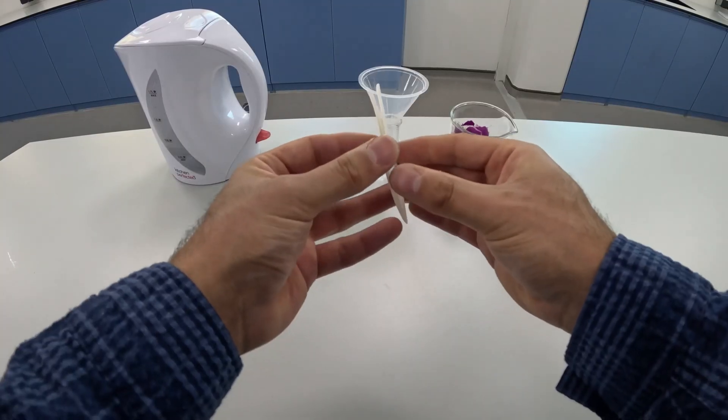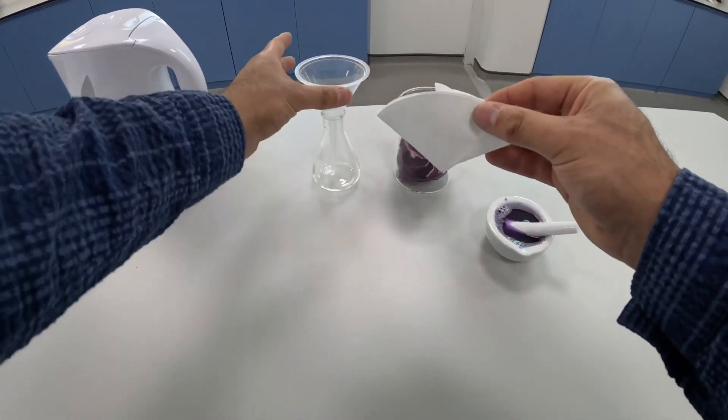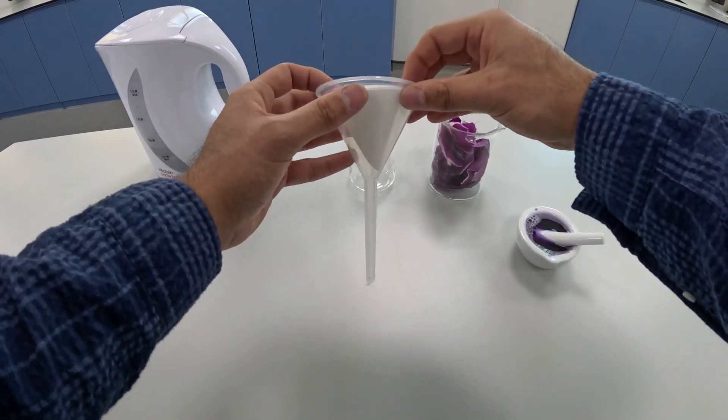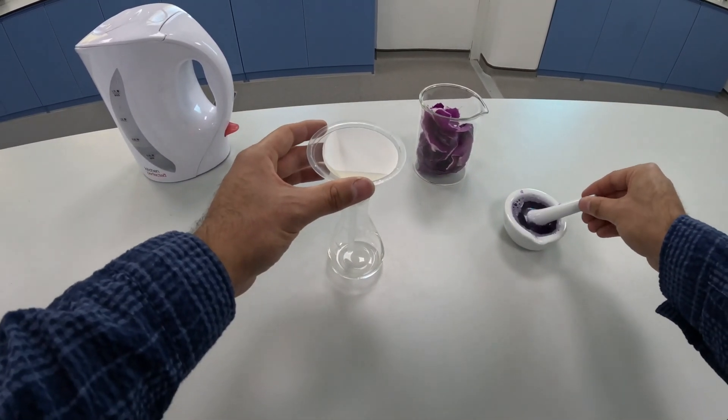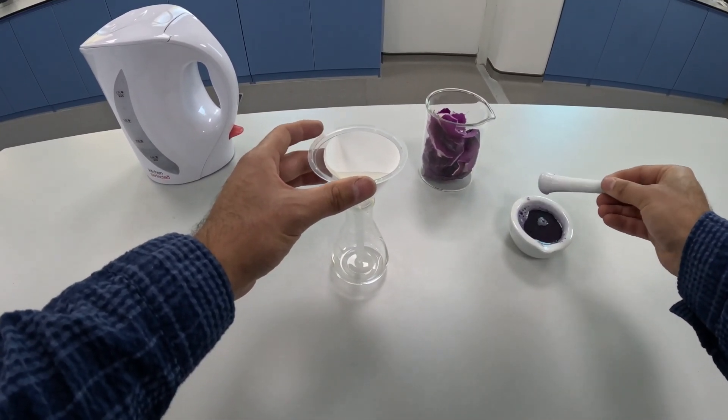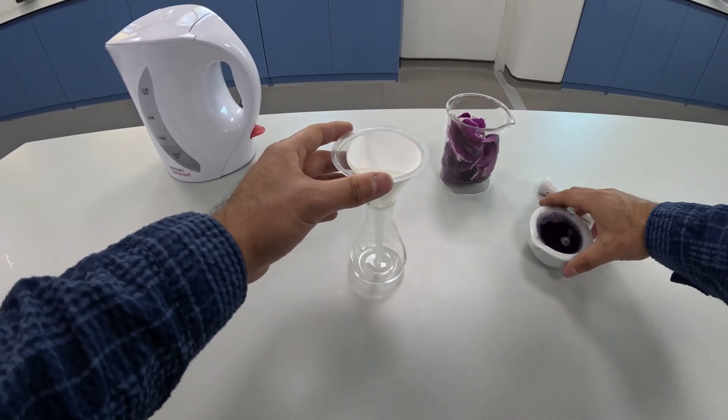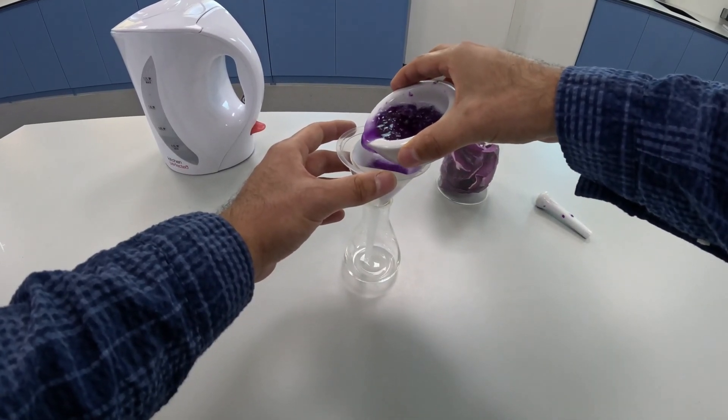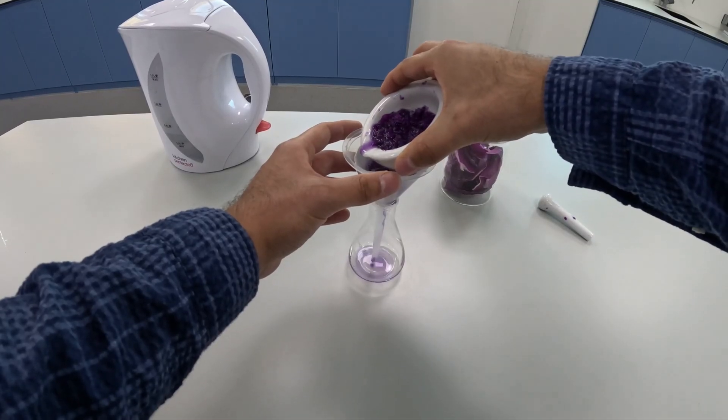And then we're going to open the filter paper up into a cone and that cone will fit nicely into the top of our filter funnel. Then we want to put this in the conical flask and slowly pour our mixture into the filter paper. We want to be careful not to overflow the filter paper.